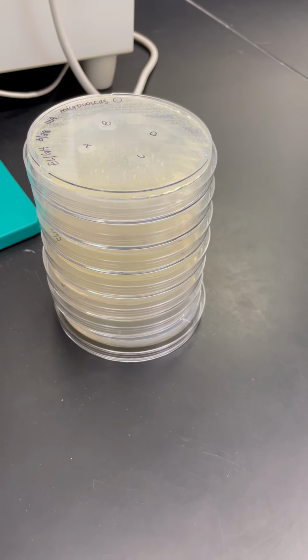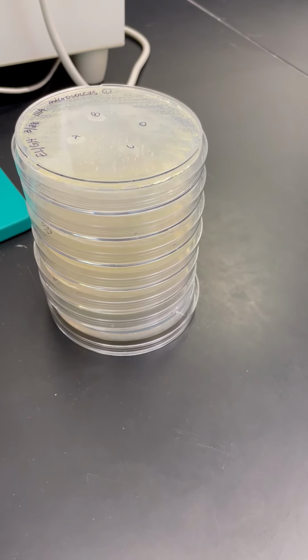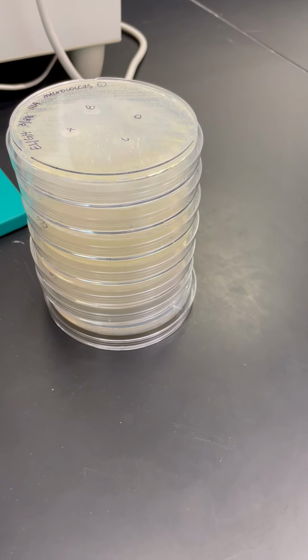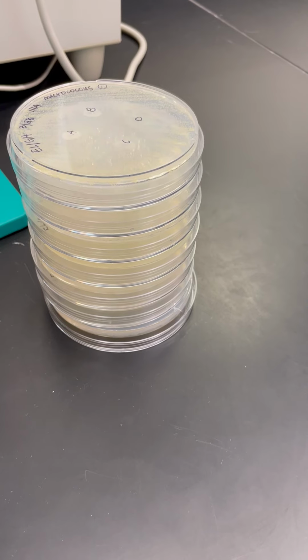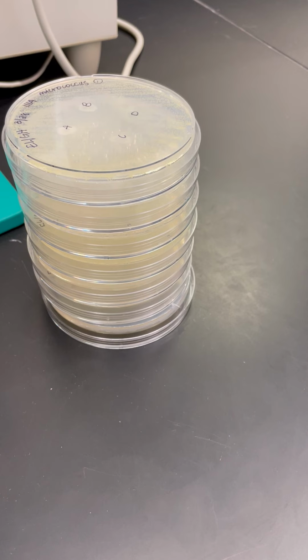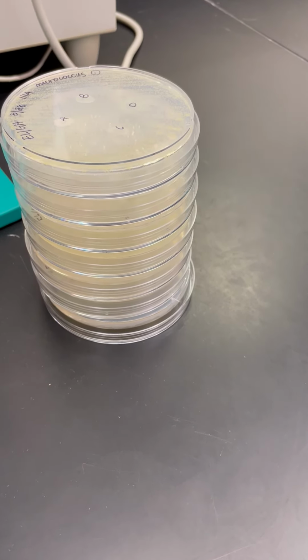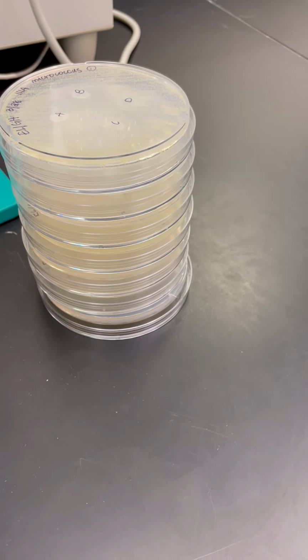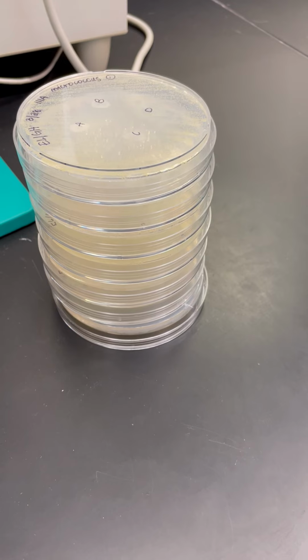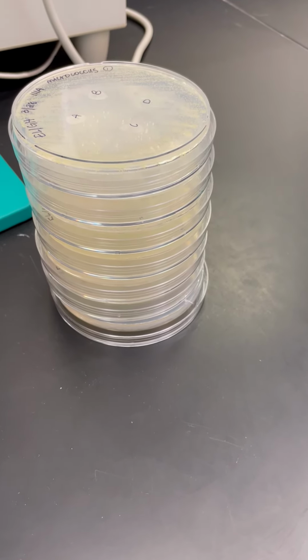So here's what I want to tell you. We're going to start with Micrococcus to see the effect that A, B, C, and D have on Micrococcus, looking for zones of clearing. No zone of clearing is a minus. Sort of one is a plus minus. A zone of clearing is a plus, and a very large one is plus plus. I hope that's clear. You're going to be making a chart, just like I showed you in class, and I hope that it'll help you.